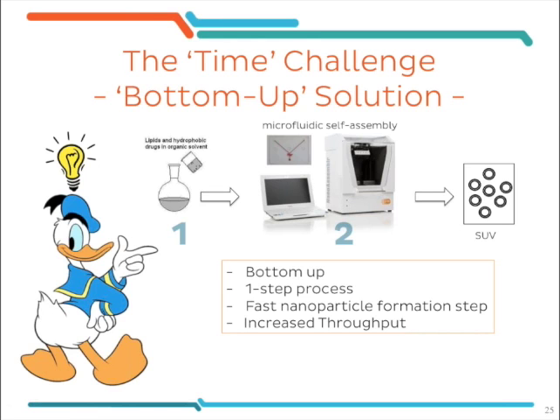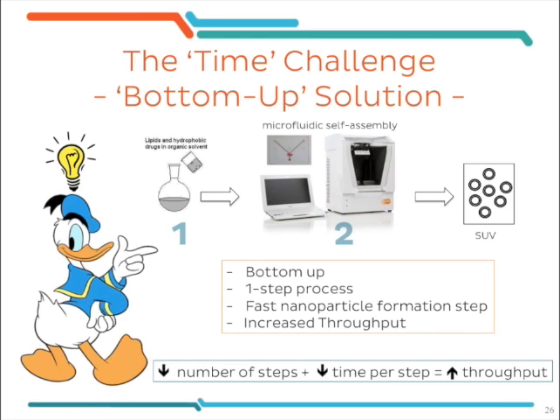So by reducing the number of steps and the time involved in each iteration of the nanoparticle formulation process, we can reduce the overall time needed per formulation and thereby increase the throughput in the whole formulation development.